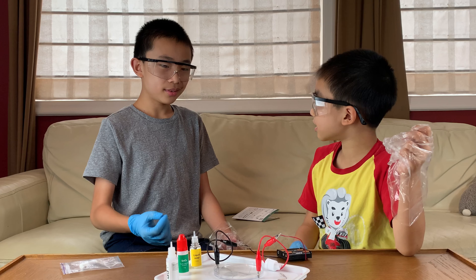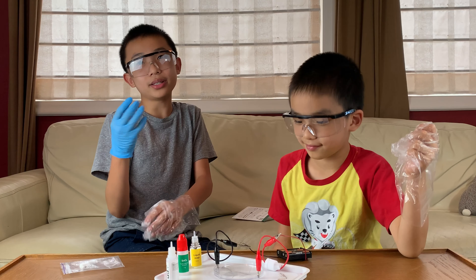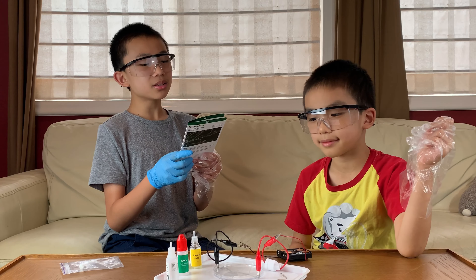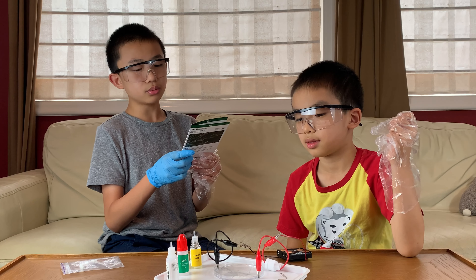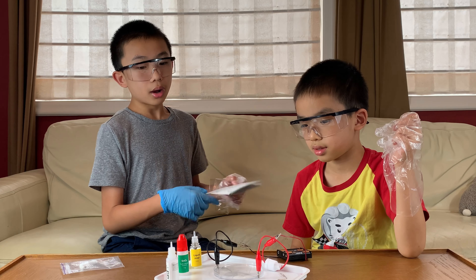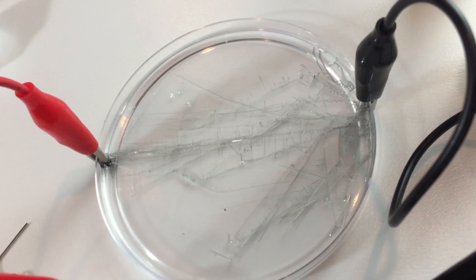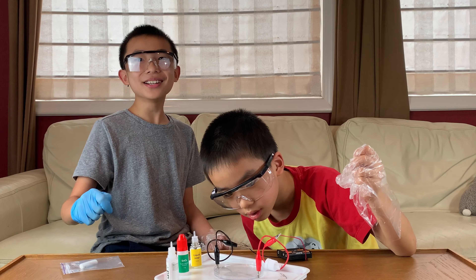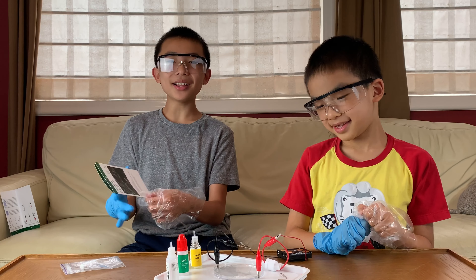It grew so much! The minus or black one is capturing the electrons and making the tree grow, while the red one is giving electrons away — that's why a tree is not growing on that side. The red crocodile clip will eventually dissolve if you don't disconnect it. And I can actually see it dissolving! That is tin dendrite.